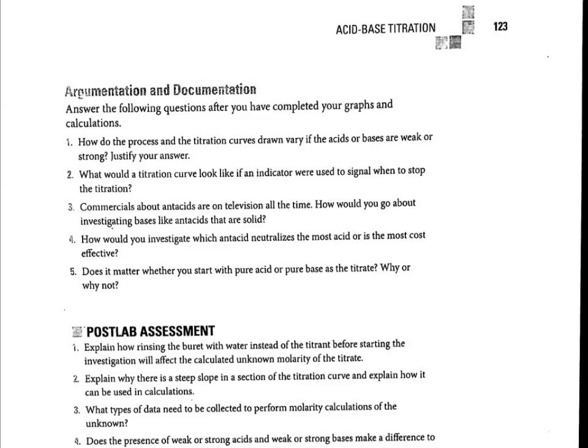Okay, so argumentation and documentation. Answer the following questions after you've completed your graphs and calculations. How did the process and titration curves drawn vary if the acids and bases are weak or strong?